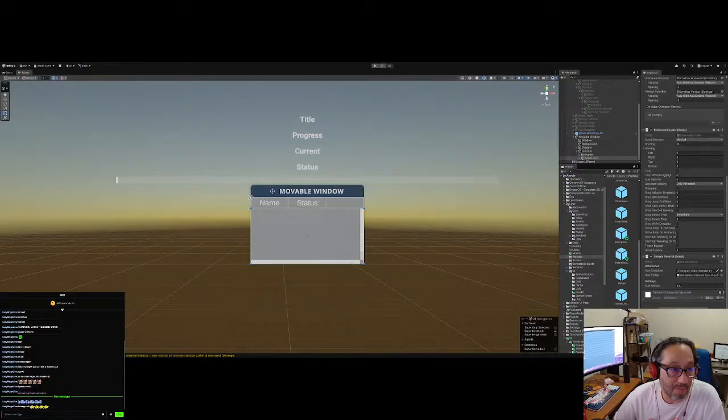We load the samples, right? But before we do that, we're going to make sure that the authentication service is authenticated and you're logged in. You don't want people messing with the data or seeing data they're not supposed to. Later on, we could put in row-based rules, which means the lab techs could see the samples, but those who are testing can't. If you add an inventory module to this, and people are just in charge of inventory, they shouldn't be able to see samples, right? So you set that here, okay?